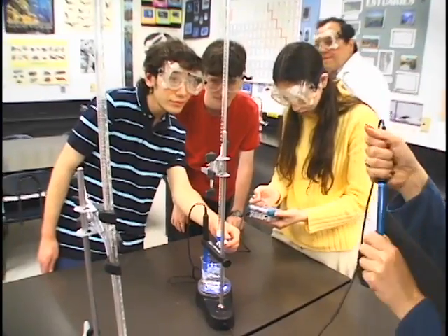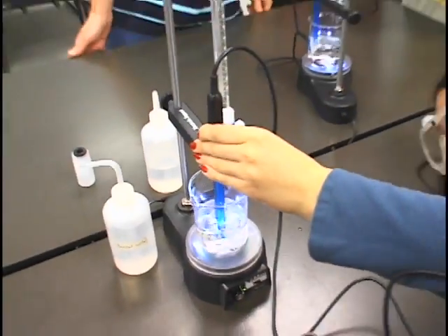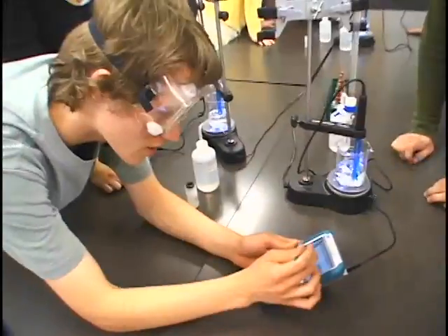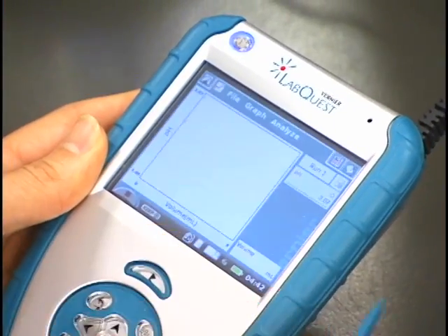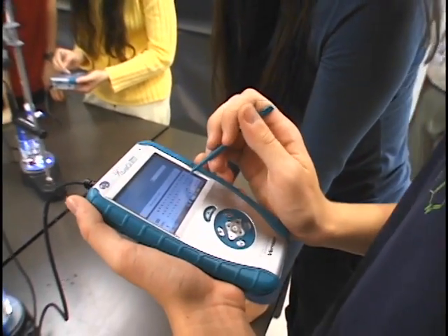It's pretty clear to me that there's huge advantages of using probeware. And it basically boils down to you're letting students take data like scientists take data. It takes the tedium out of taking data and lets the students concentrate on the real science behind the experiment. It allows you to do experiments you couldn't do before, very fast experiments involving sound or collisions, but it also allows you to do long-term experiments which can take days or weeks even, and would be incredibly boring or impossible without technology.